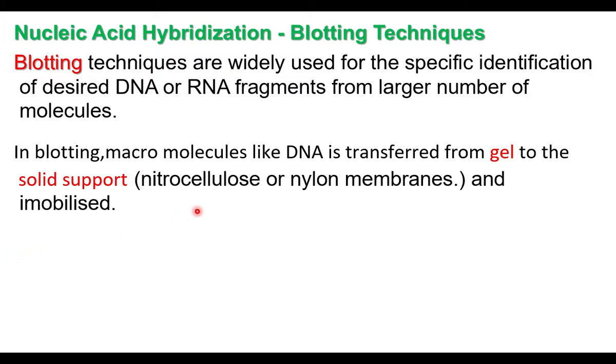In blotting technique, DNA is transferred from gel. In the previous video we discussed about gel electrophoresis. In gel electrophoresis, DNA molecules are separated based on the length. This DNA on the gel are transferred to nitrocellulose or nylon membranes and fixed. This is blotting technique, transferring of DNA pieces from agarose gel to a solid support and fixed.